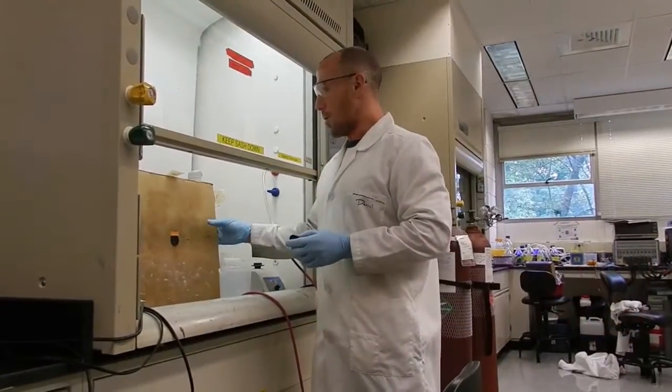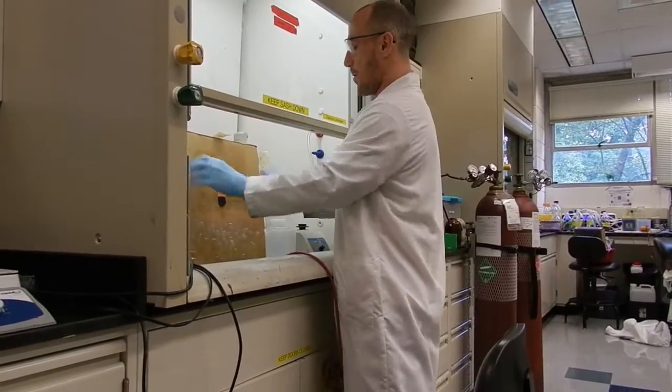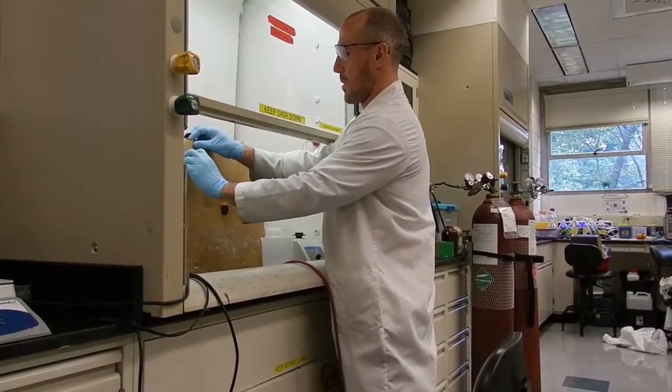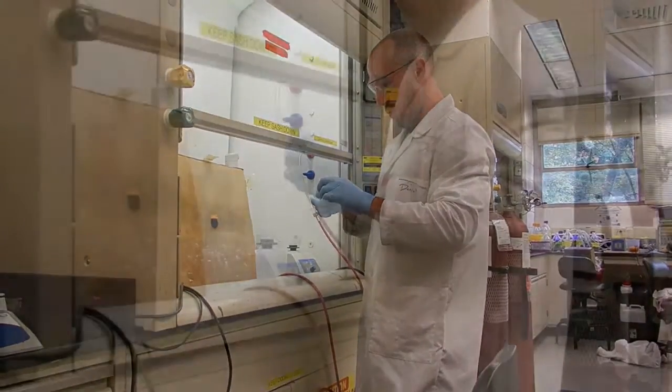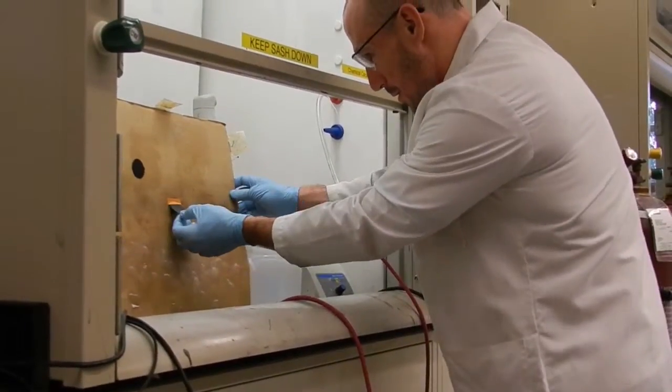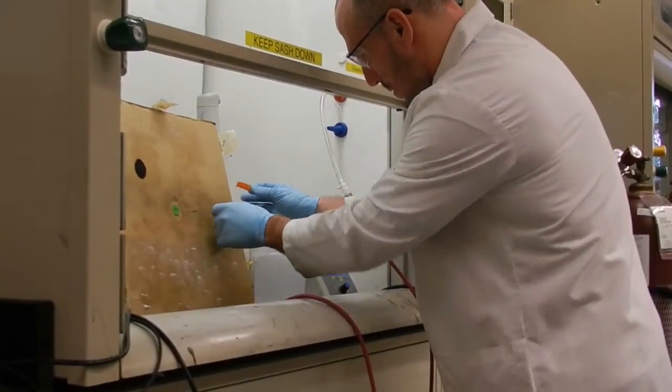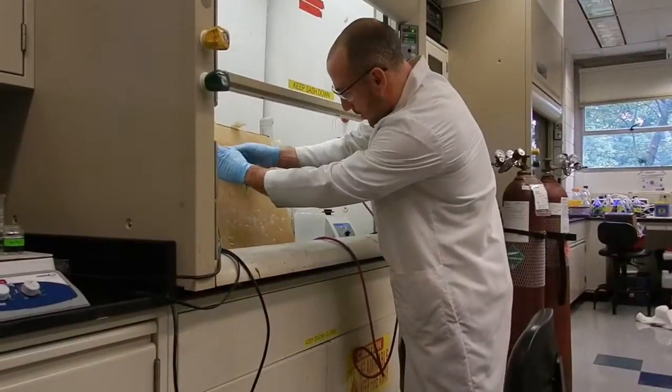First, we're going to take our cathode and we're going to fix it to something that we can spray on. I've chosen this big piece of cardboard so that we can keep the splatter from going all over the fume hood. Once you've fixed it, you're going to want to put something across the top of the cathode so that you can preserve a place for your connection point in your microbial fuel cell.